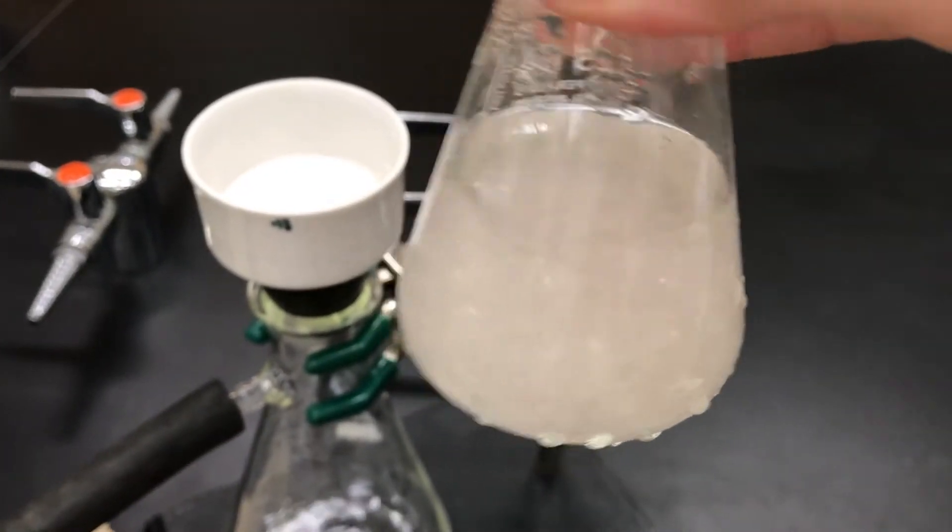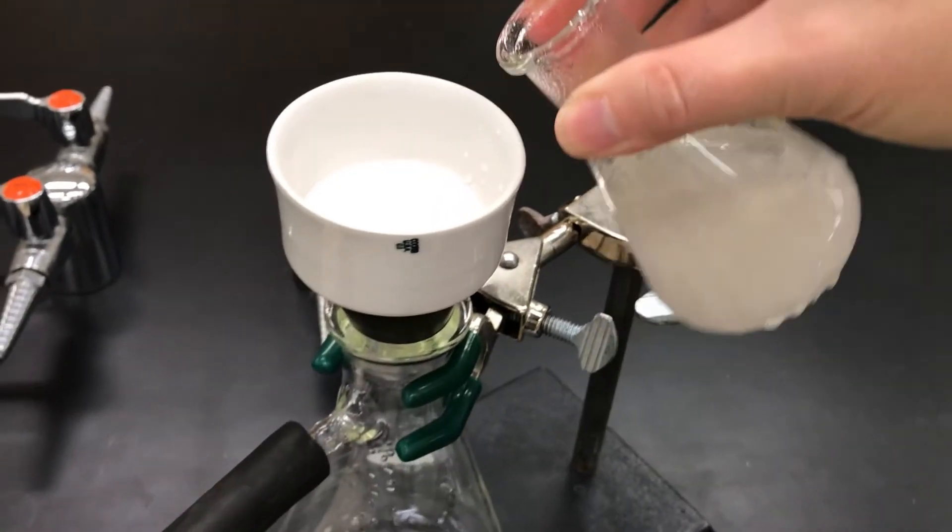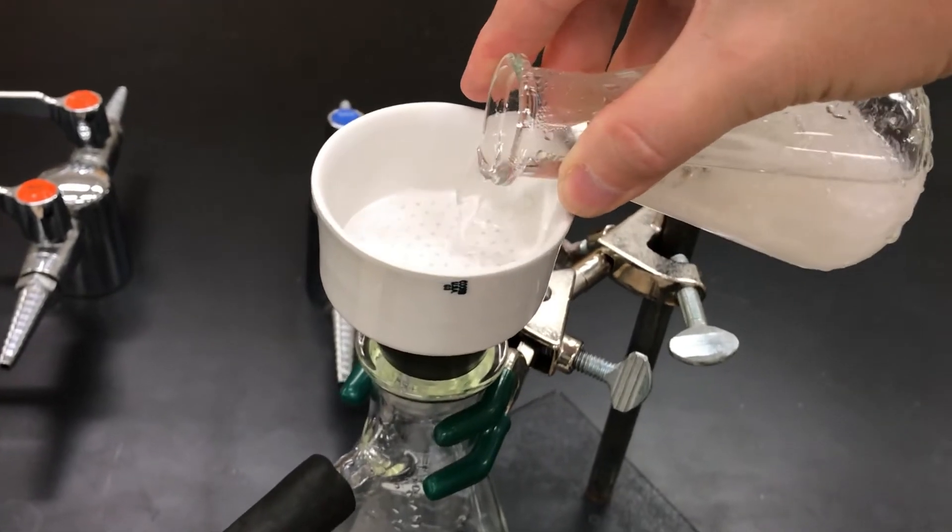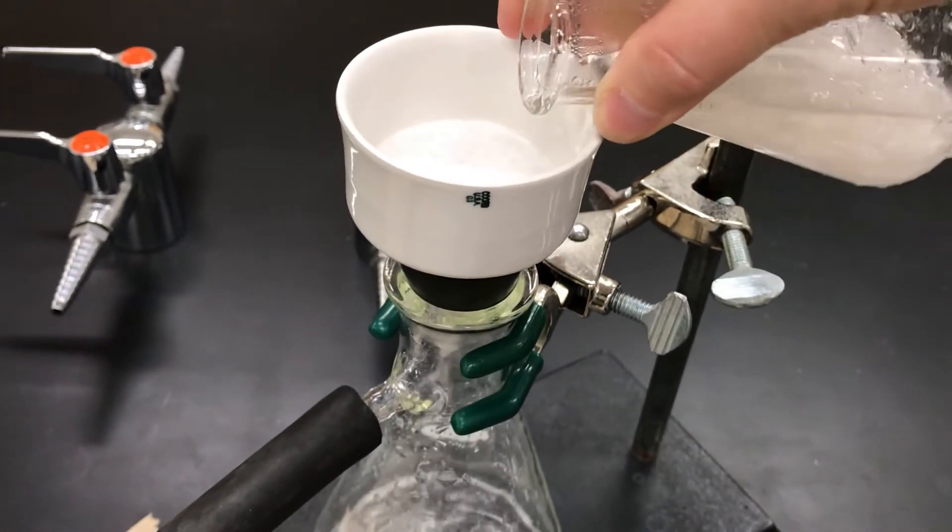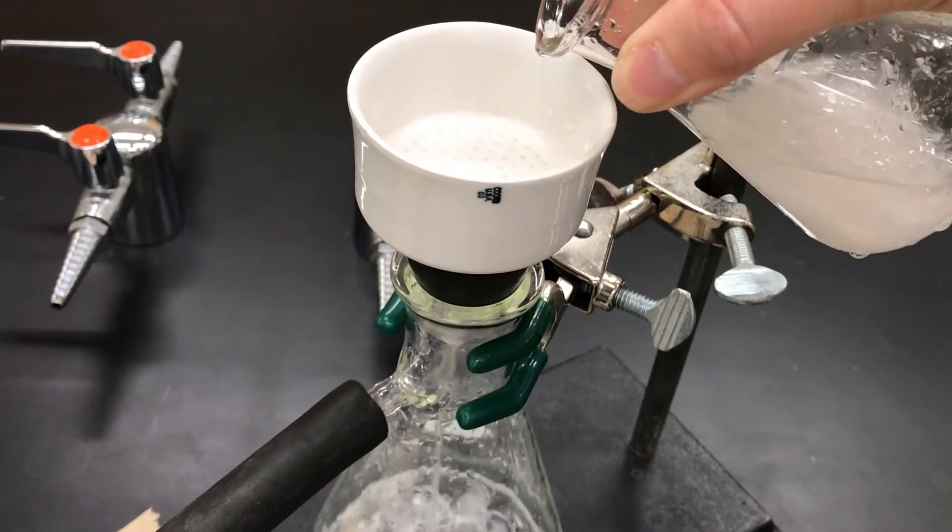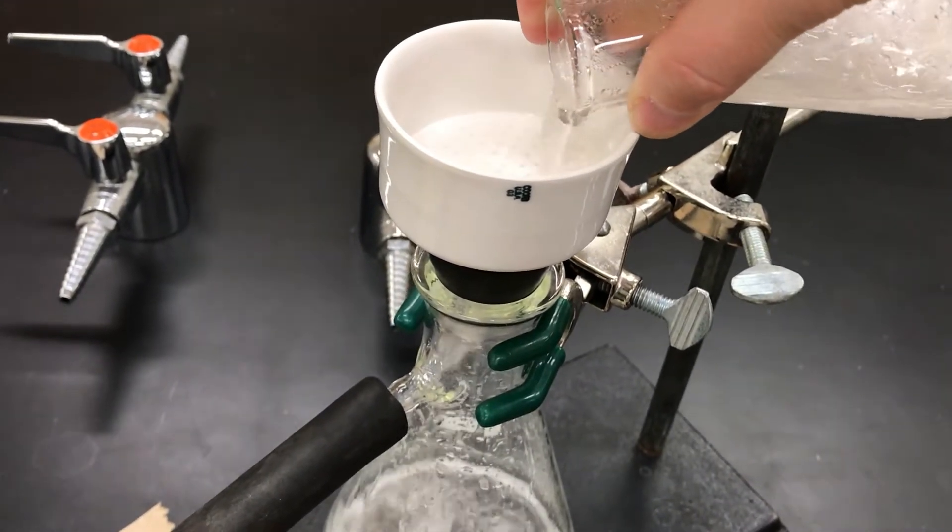So here is my solid and I'm going to pour it into the funnel in portions. The suction is then going to pull the liquid away from the solid. The solid gets trapped above the filter paper.